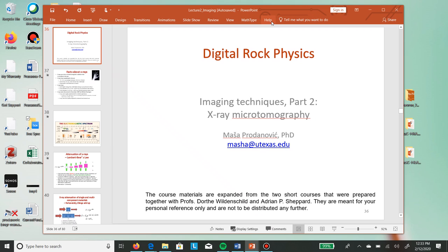Okay. So what we will continue talking about, since this is quite dominant still in characterization of geomaterials, is that we're going to spend a little more time detailing how these images are acquired. Hopefully, because you've seen the instruments physically first, and now I'm going into details of how images are acquired, that will click together. That's one point. And the second point is that knowing whatever imaging you're doing, and what the potential sources of error are, also makes you understand what you can do.